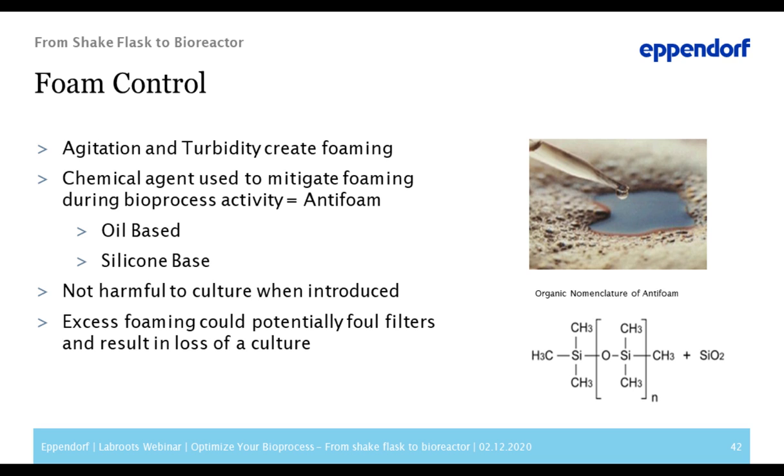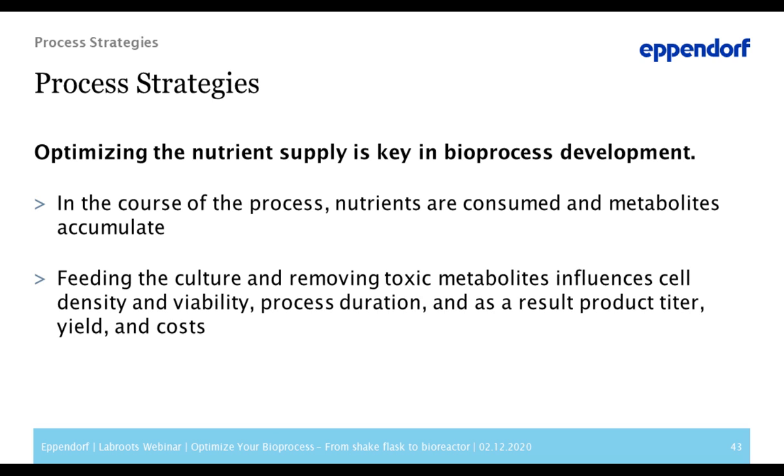And I mentioned it already, but especially in fermentation processes, the increased agitation and the gassing rate causes foaming problems. Foaming can be monitored with the help of level sensors that can distinguish between foam and liquid. Once foam is detected by the sensor, a pump can start that adds the anti-foaming reagent. This prevents foam out events and is especially useful when you are running longer experiments overnight or over the weekend.